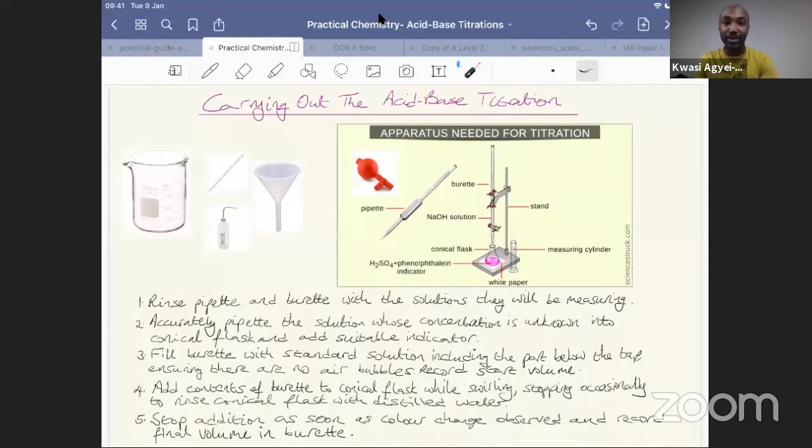It often leads to a disastrous breakage of your pipette because students tap the pipette against the sides of their flask. So that tiny drop at the end of your pipette, don't worry about it. You just need to touch the tip of your pipette to the surface of your liquid, and then that's your measurement, the transfer done into your conical flask.